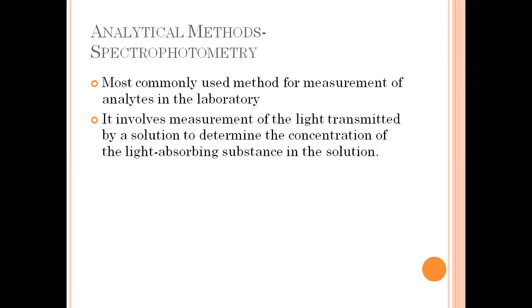It involves measurement of light transmitted by a solution to determine the concentration of the light absorbing substance in the solution. So kindly take note of that. In short, spectrophotometry is a measurement of how much a chemical substance absorbs or transmits light.